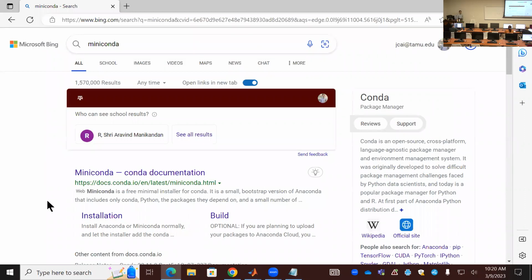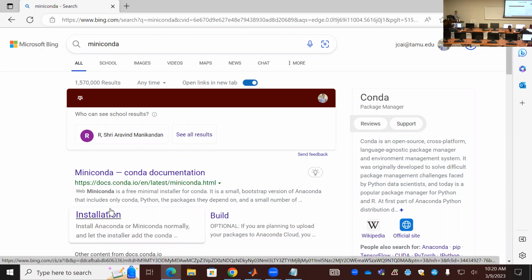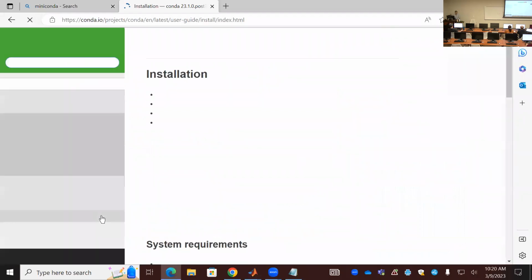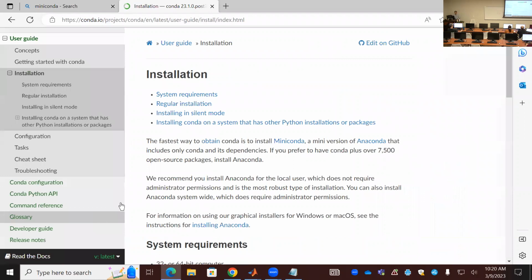So we can use this time to look at miniconda, which is an environment we are going to install for Python. Because we are waiting for the t-SNE to finish embedding, we can spend some time looking at this miniconda package.